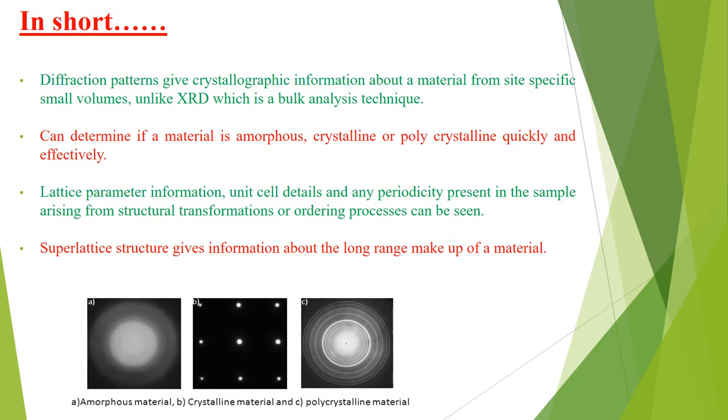In short, we can say that the diffraction pattern gives crystallographic information about a material from a site-specific small volume, unlike XRD, which is a bulk analysis technique. We can determine if the material is amorphous, crystalline, or polycrystalline quickly and effectively.